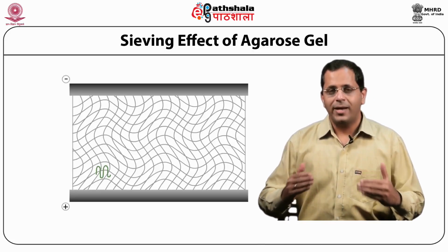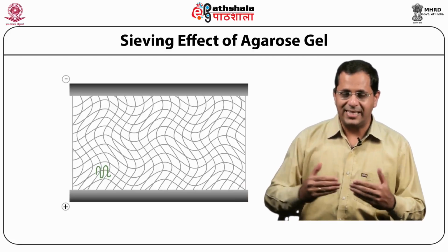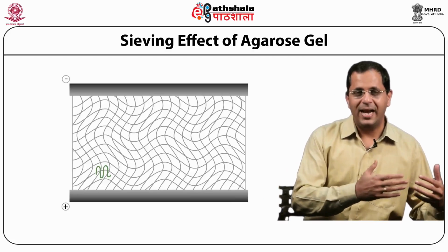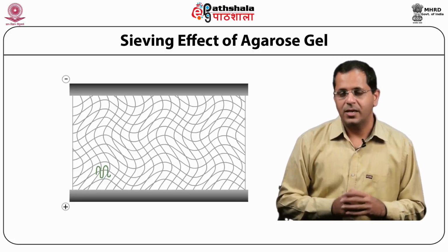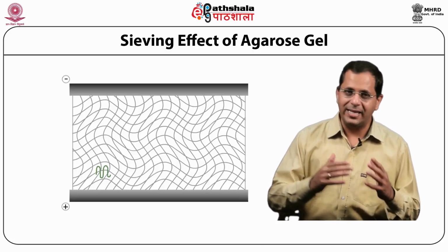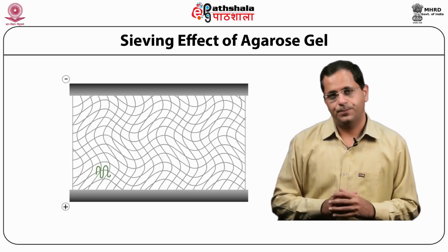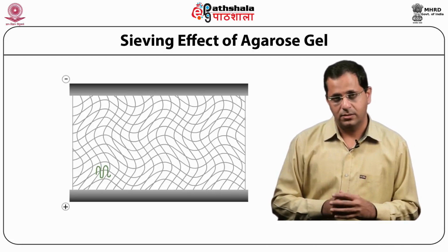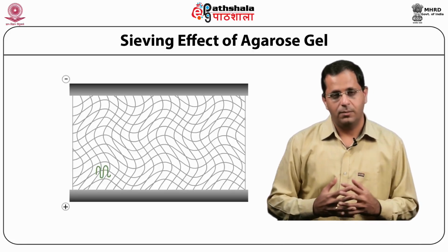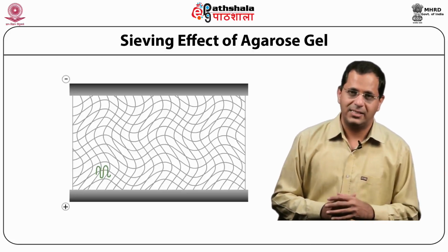So, what happens is, the cyclist, because of his size, finds it easier to traverse through the traffic and reach the other end fast. On a slightly slower side, the auto rickshaw would have to wait for space and then would slowly but surely make his way to the other end. But the slowest would be a big truck, which would find it very difficult to find space because it would be blocked by all the traffic on the road, and the truck would come out last.